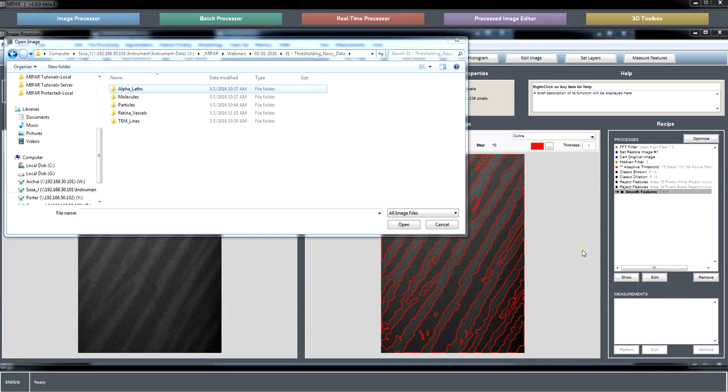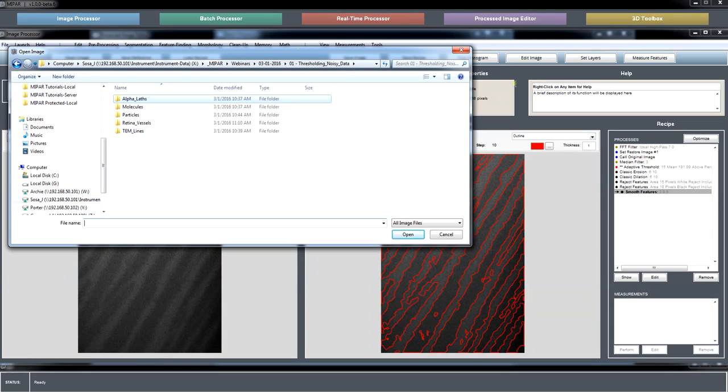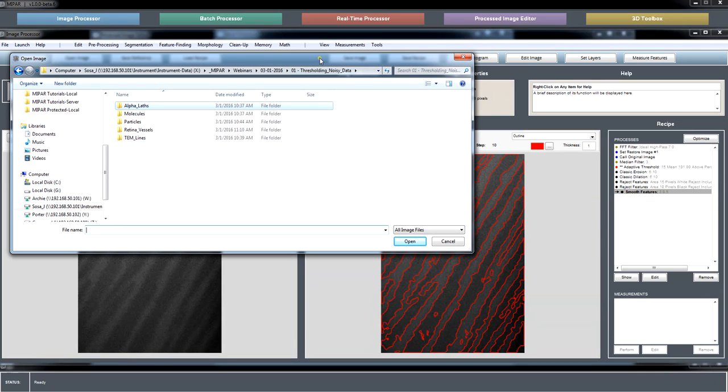Quantifying an already segmented image. Well, let's say that you had, so you're saying if your segmentation is binary, then we could open up that binary image and go after measuring the features. PCA analysis? Not directly. I mean, you can extract global measures.